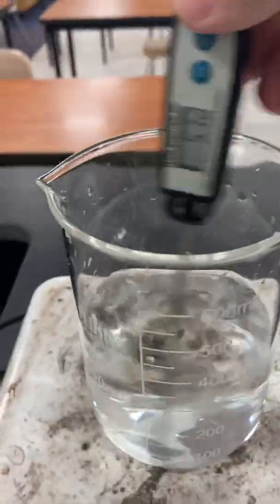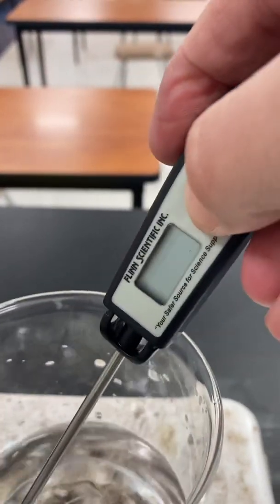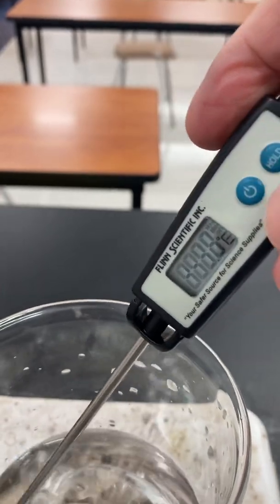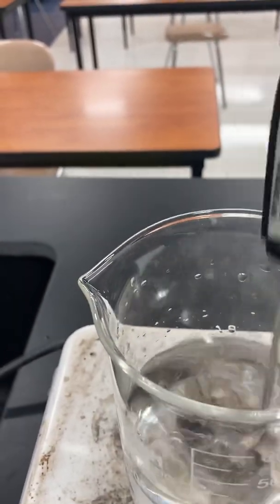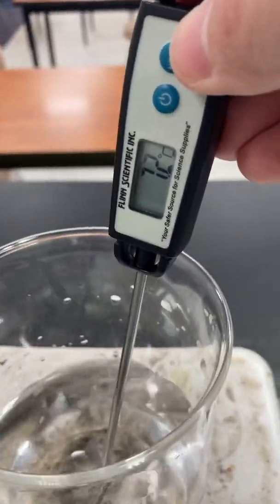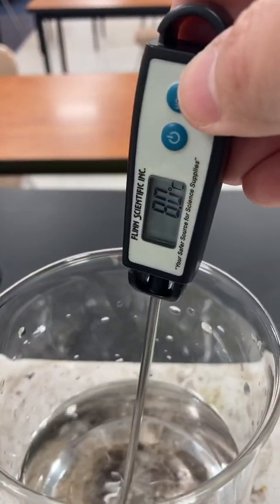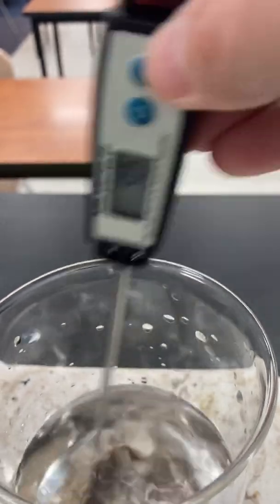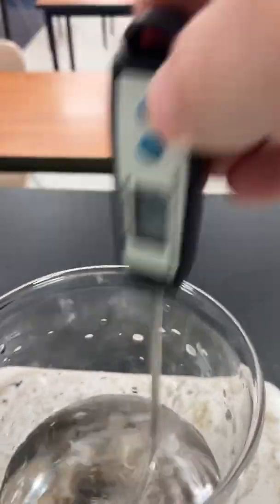Okay, it looks like my ice is almost all gone. And my temperature is at, oops, it just turned off. I'll have to kind of restart here. 5 degrees Celsius. Okay. Ice is now gone. No more ice in here. Okay, 5. Now it's really starting to jump up. Like, wow, isn't that weird once the ice is all gone? Now we're at 3 minutes and 30 seconds.